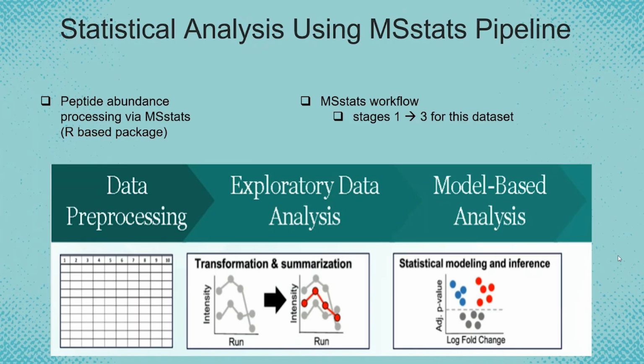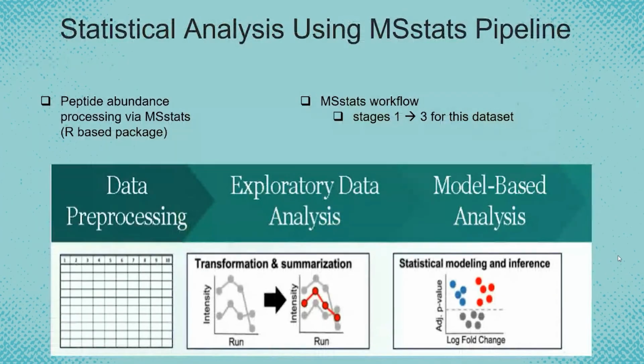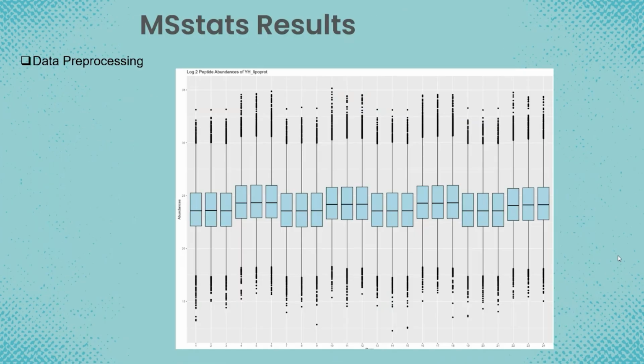A quick note: the MSstats workflow is standardized, so for other data sets, we can compare and add to the archaeal project. So the first thing in this workflow is data pre-processing.